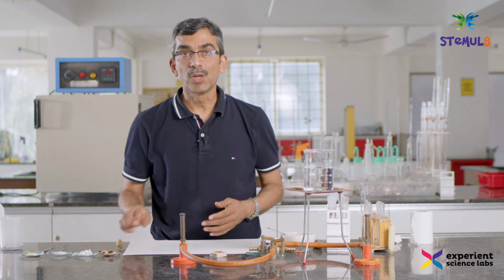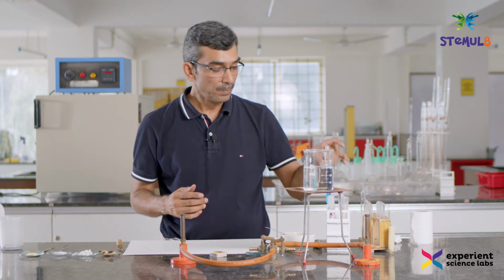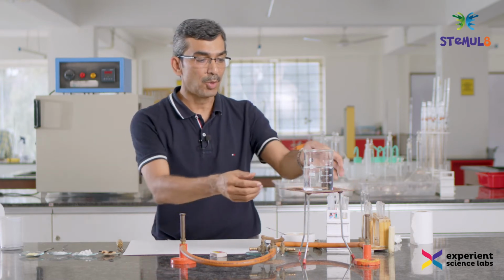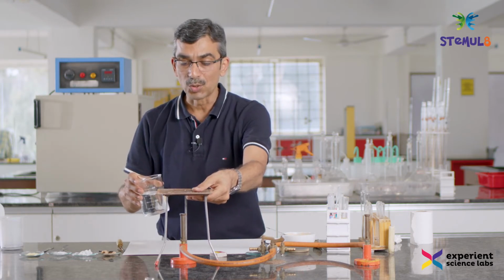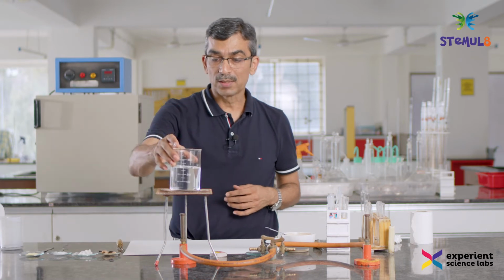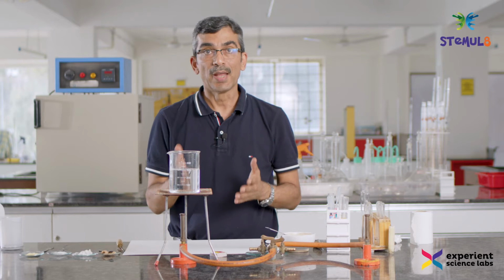Now for testing sugar, as I said, we need Benedict solution, and we also need heating. So what I will do is I will start the heating process. In the meantime, I will also explain how this process is going to be done. So what we are going to heat here is water. We are not going to heat the test tube directly.